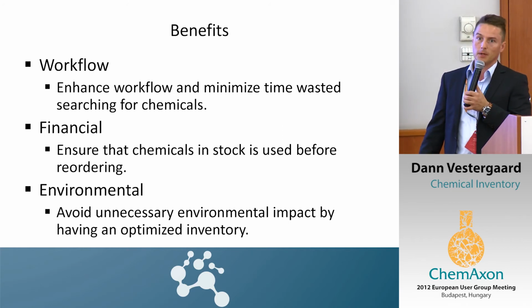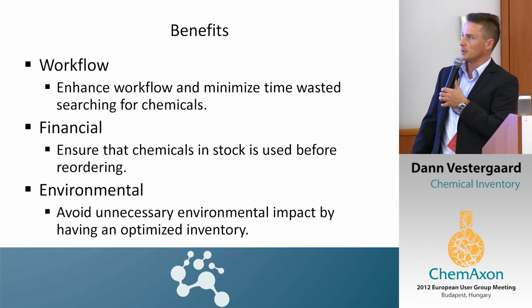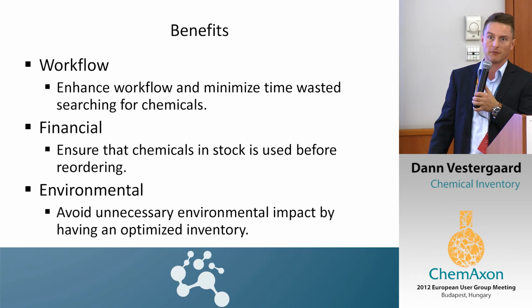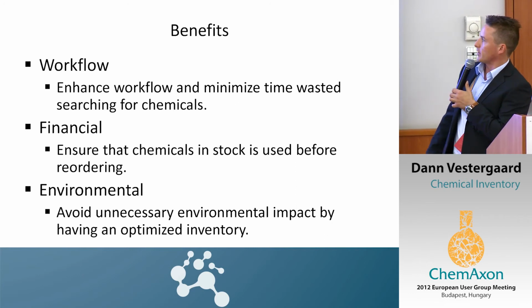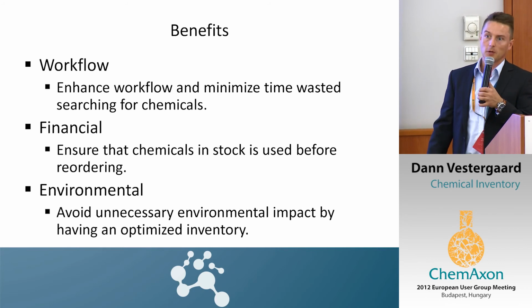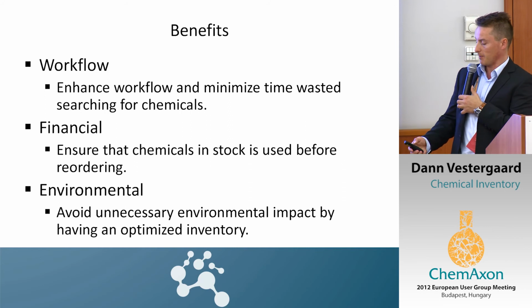Financial as well. Use the entire bottle before reordering. The system will maintain that information for you. And environmental, of course, by having an optimized inventory, you will be able to reduce the environmental impact.